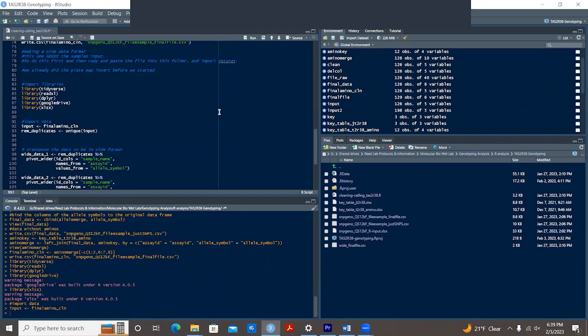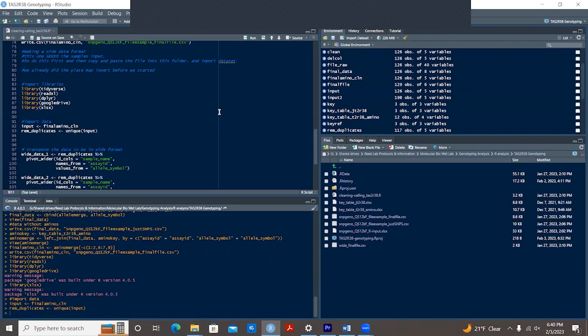When we run this line, we're saying we're removing the duplicates from it. So that's why I called it rem duplicates. And the function is unique. And then we're telling it which thing it's uniquing. And when it uniques, it's just deleting every duplicate. So I'm going to run ydata1, which is our remove duplicates file.